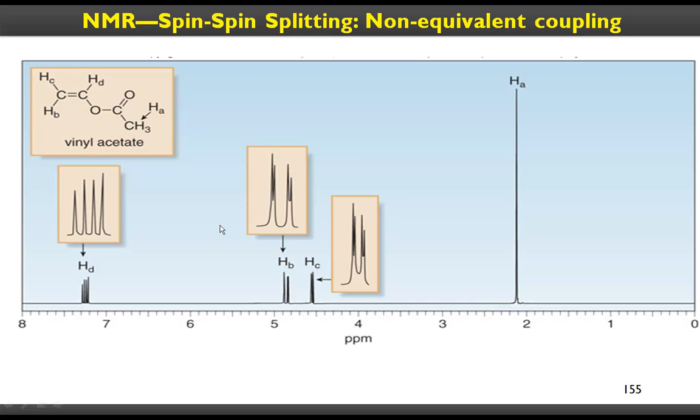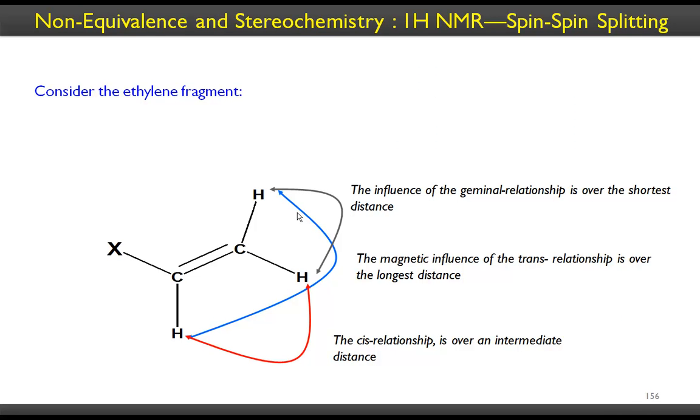The coupling constants are very small when they are geminal. When they are vicinal, their coupling constants are much higher. Okay, here is the depiction of that. These two are close in their dihedral angles, so they don't split each other that much, and these two are cis, these two are trans. Trans hydrogens couple in a stronger fashion, more intensely, than the cis hydrogens and the geminal dihydrogens.